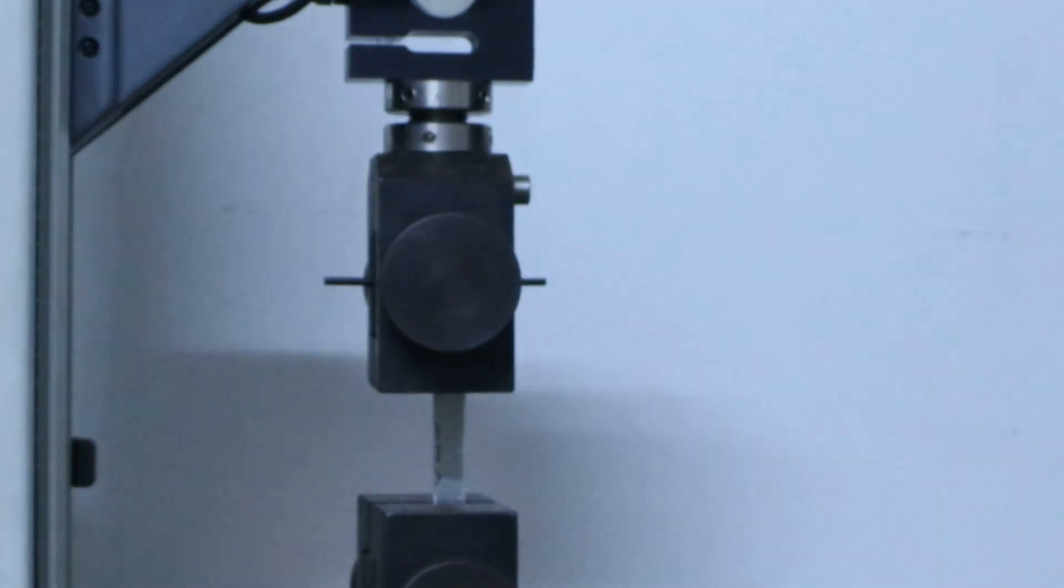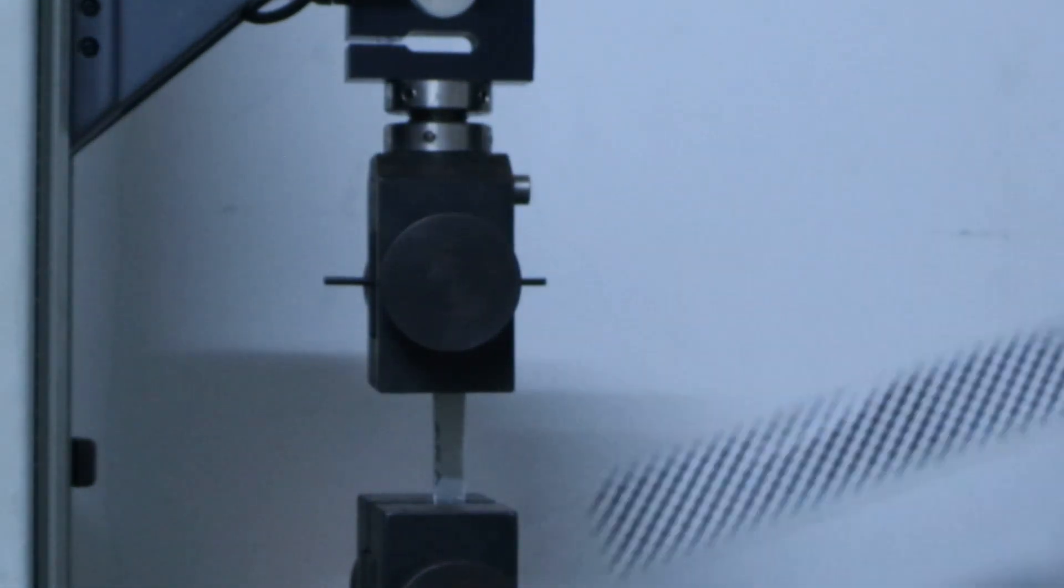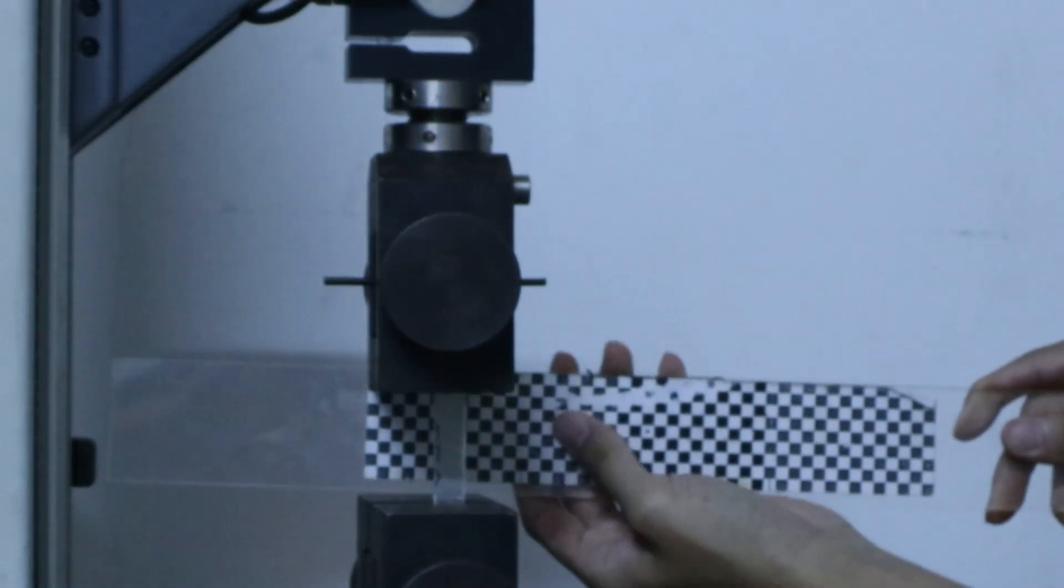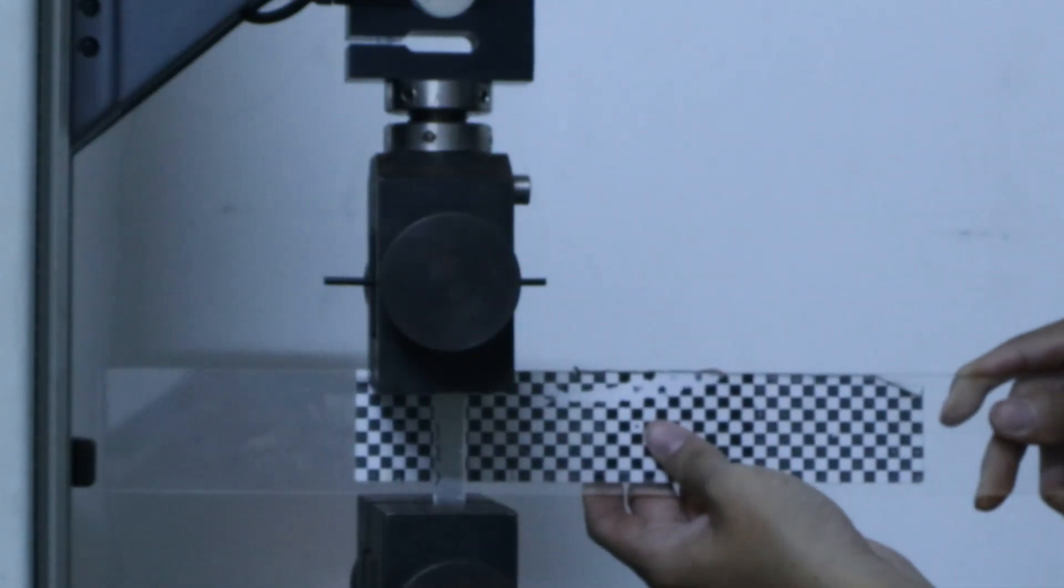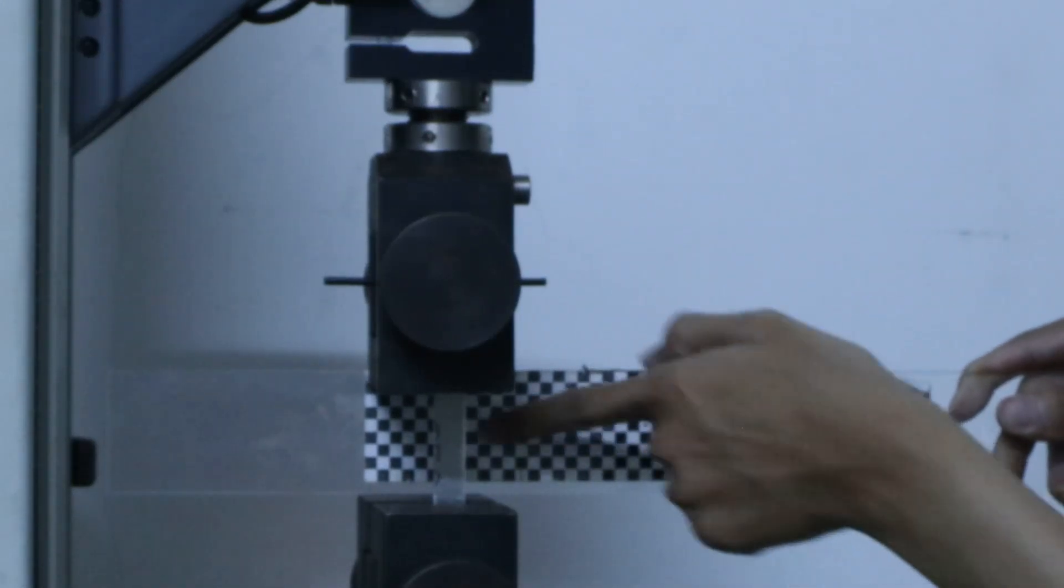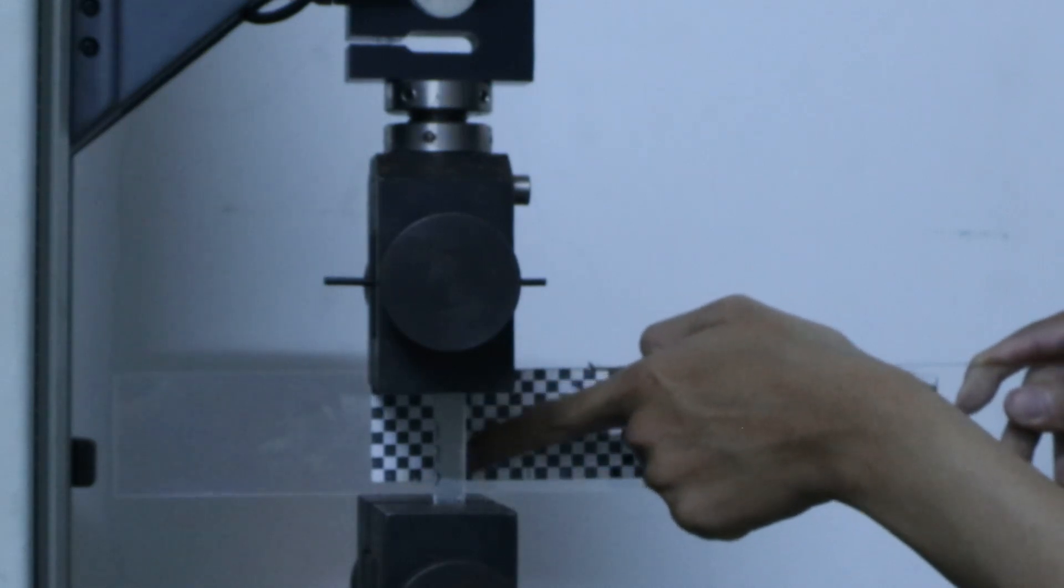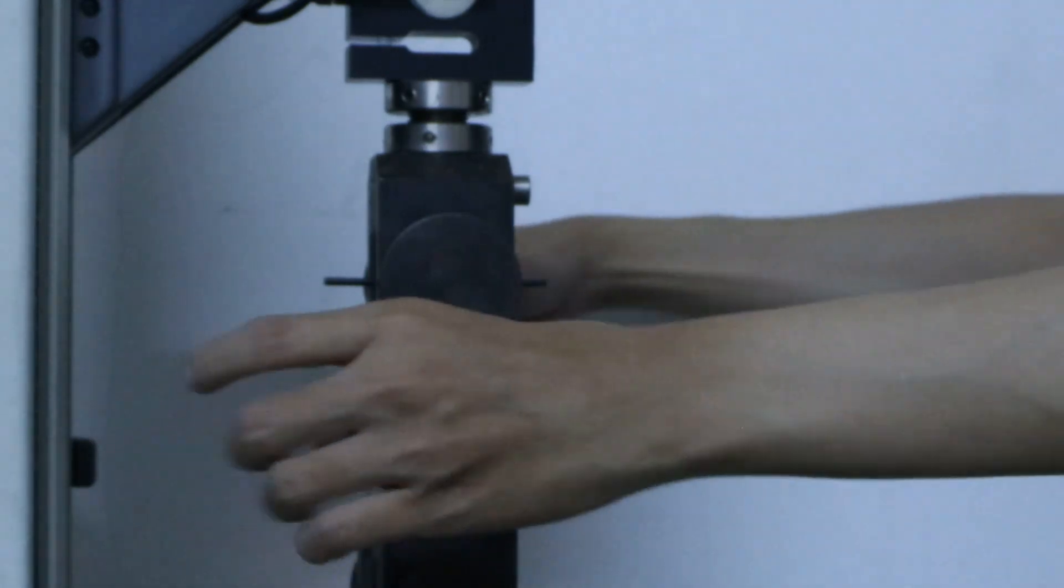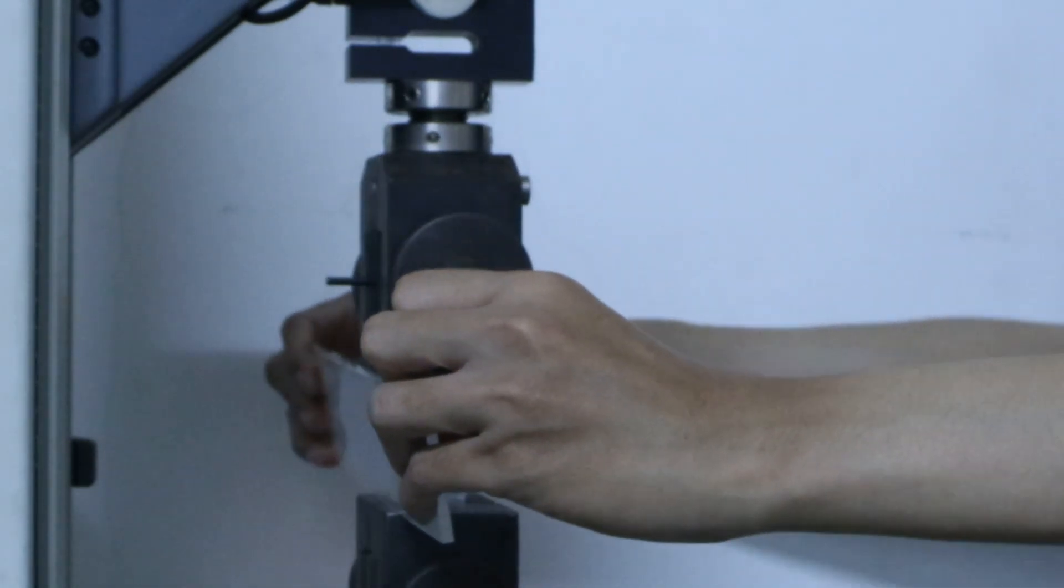And to check whether it is straight or not, you can use this calibration board or checker board to see whether it is straight. Just try to align it on the corner of the black side and see if it is straight. Try to check on the other side too to see if it is straight.